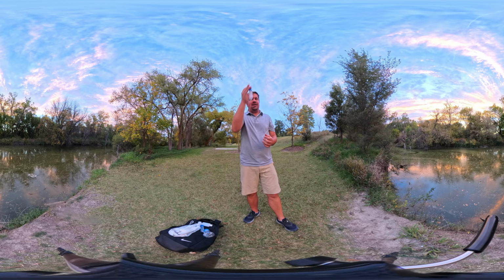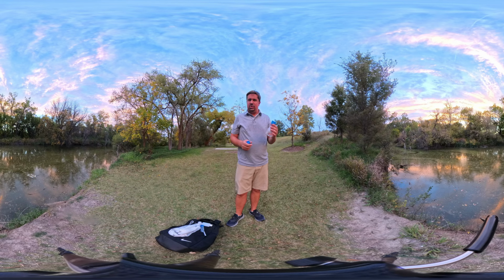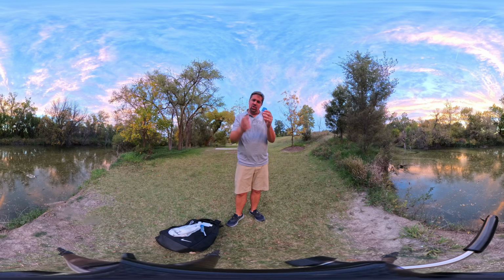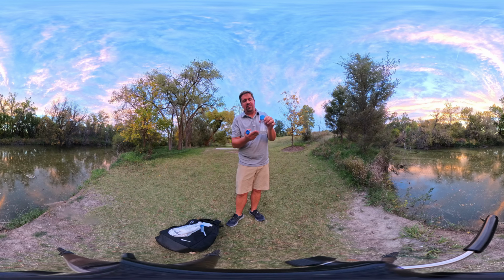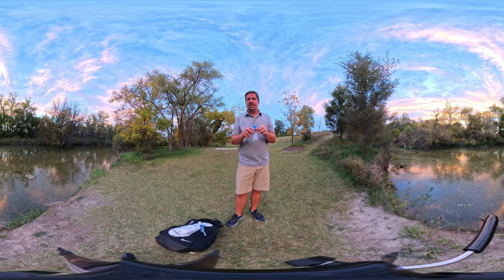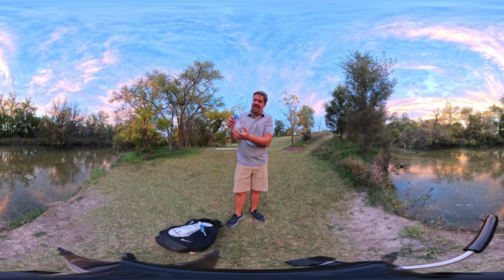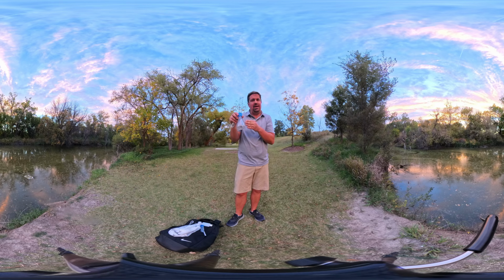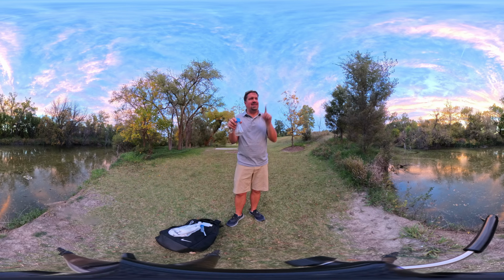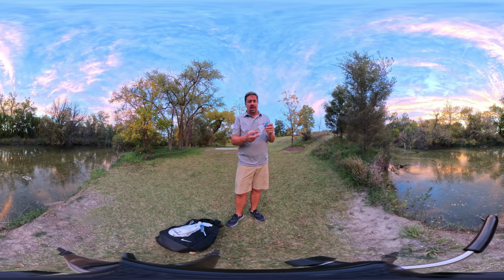And then when I'm back in the laboratory, a teaching assistant of mine or one of my student research assistants, or I myself, are going to fill them over into an actual culturing flask that will be filled with the appropriate culturing medium. There are certain nutrient media that cyanobacteria love, and we would then try to have them cultured in that flask, literally make a small mini bloom in there, so that we can first accumulate and then harvest these presumed cyanobacteria that you see here behind you in Big Creek.